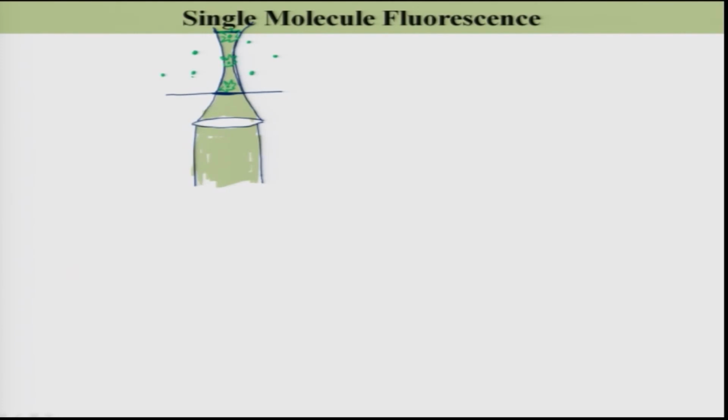If you now decrease the concentration of the molecule in the sample, but your observation volume is large, that means your background Raman scattering will be much more. So your aim is not fulfilled. That aim is to create a small observation volume.